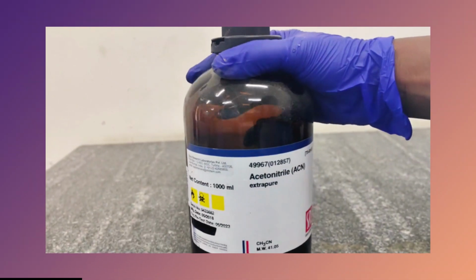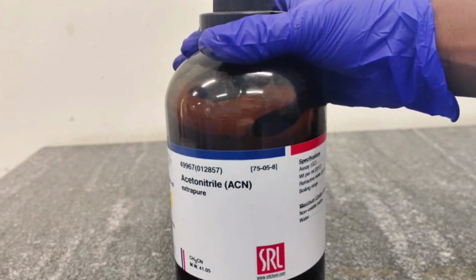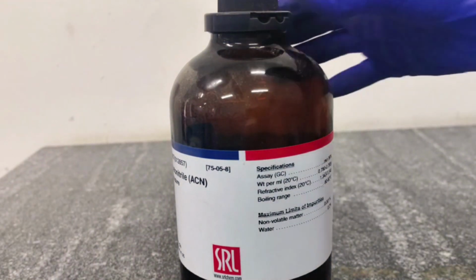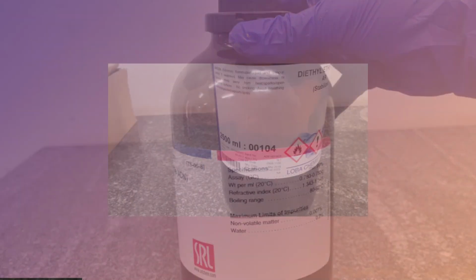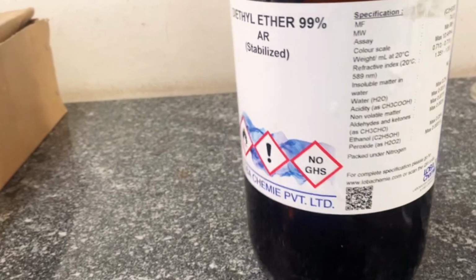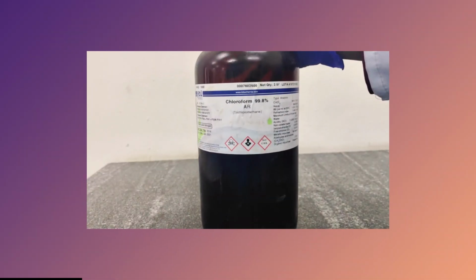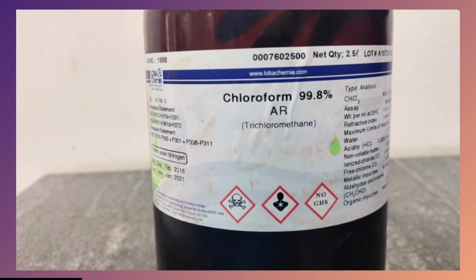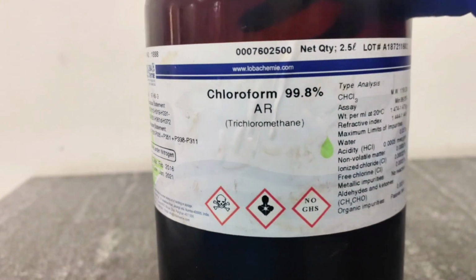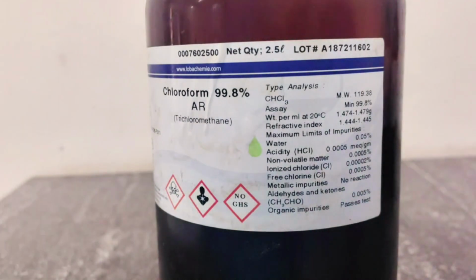Acetonitrile can be swapped with dimethylformamide or methanol, especially in high-performance liquid chromatography. Make sure their polarities and concentrations are suitable for the required synthesis. Diethyl ether can be replaced by acetone or hexane for extractions, but adjust concentrations to keep similar reactivity. Chloroform can be substituted with dichloromethane, which is less toxic and works similarly in separating organic and aqueous layers. Keep the concentrations the same to ensure effective separation.